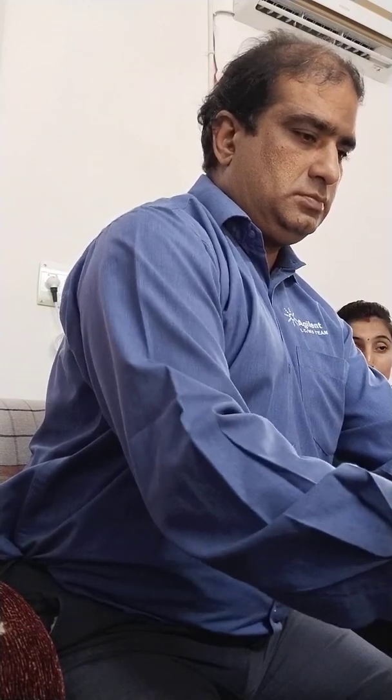So this is done. Let us now save the method as 2nd August. Next time, if we want to do MSMS, we can select this method and run the sample. You have to adjust the chromatography. You can take the source parameters and everything from here, but the chromatography you have to change.